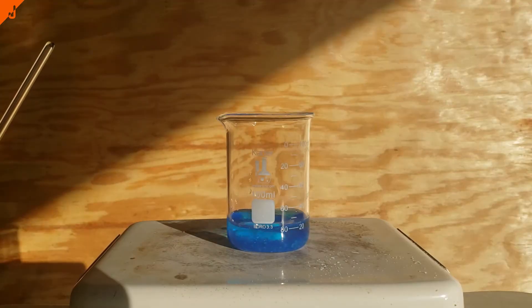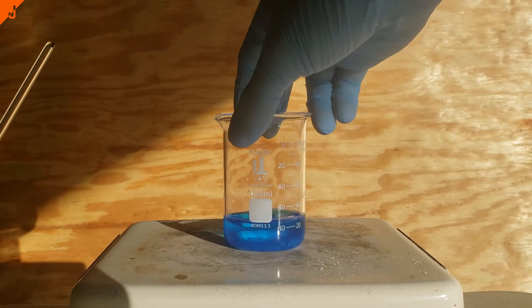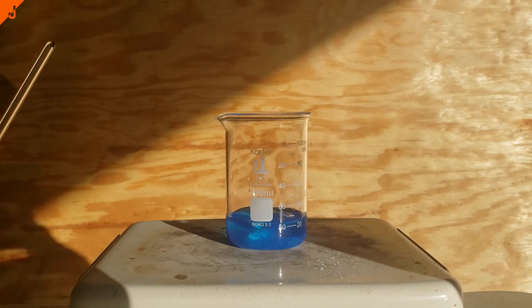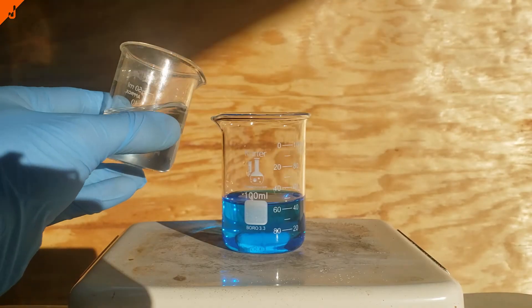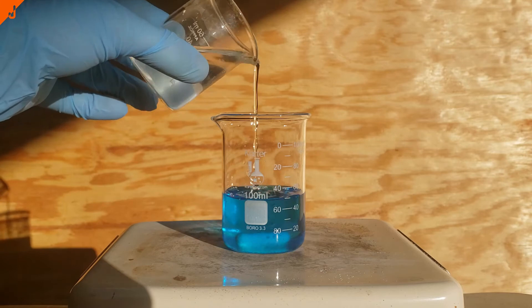To get everything to dissolve in the copper-sulfate solution, I ended up stirring it. Once pretty much everything had dissolved in each solution, I then began slowly adding the potassium bromide.